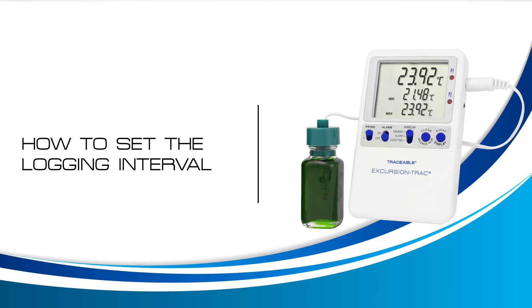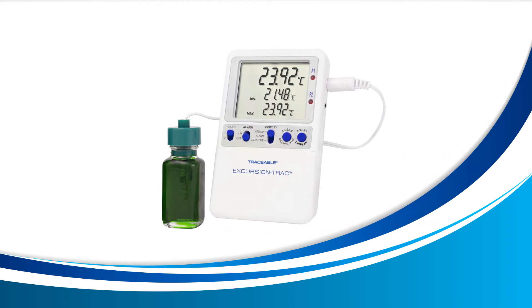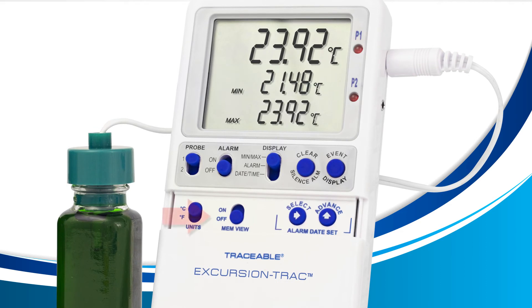Let's find out how to do that now. The first thing you'll want to do is slide down the bottom half of your thermometer to reveal the additional buttons and switches. Next, locate the MEM VIEW switch — you'll find it right here.